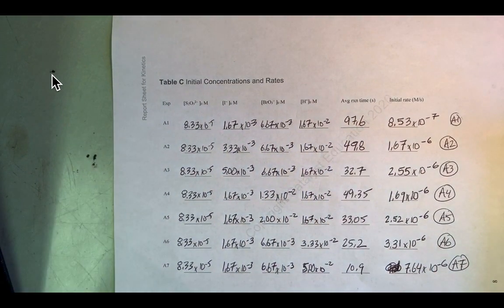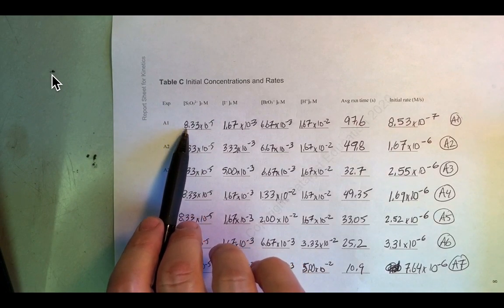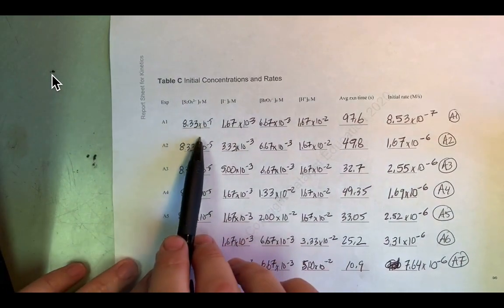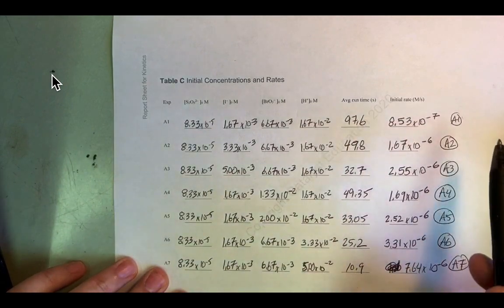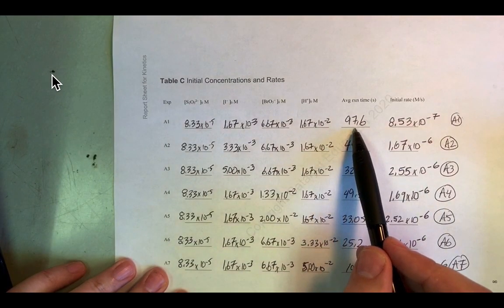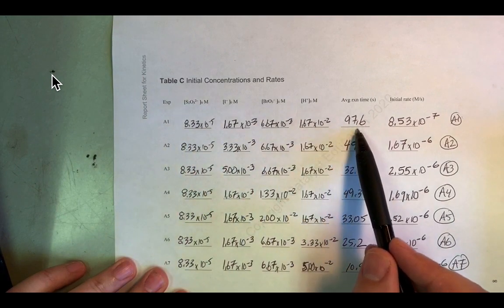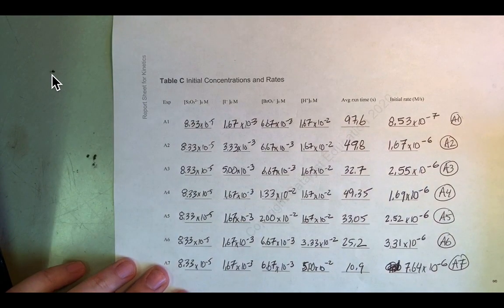So the concentration change went from 8.33 times 10 to the minus 5 down to 0. So 8.33 times 10 to the minus 5 minus 0 is 8.33 times 10 to the minus 5. And it happened over this length of time. So basically, mathematically, I take this number, divide it by this number, and I'm given my initial rate here in molarities per second.